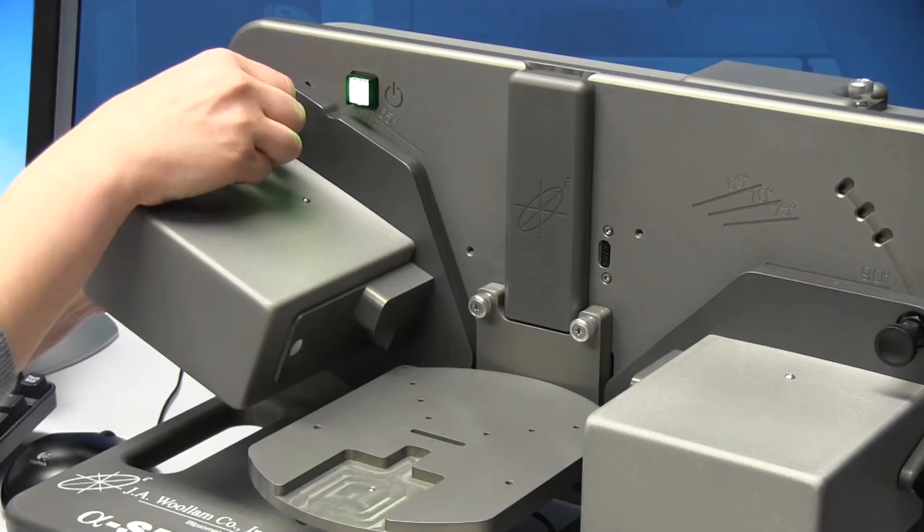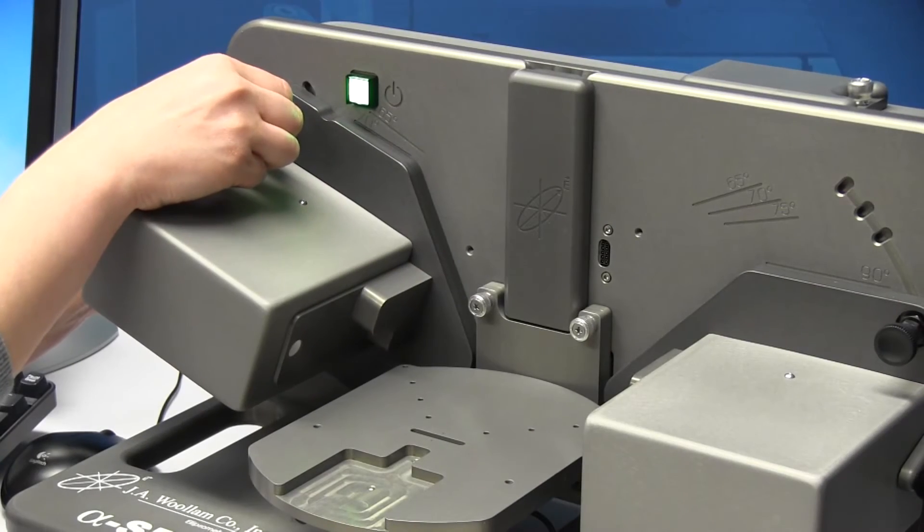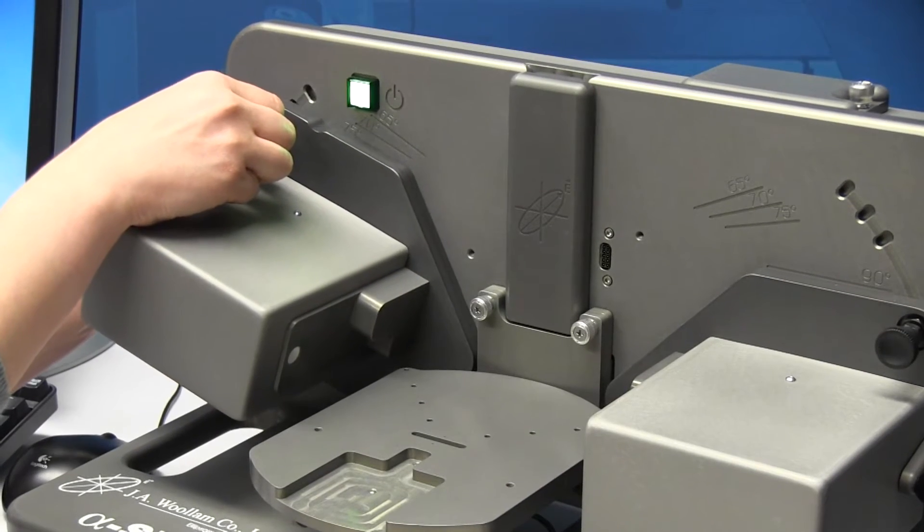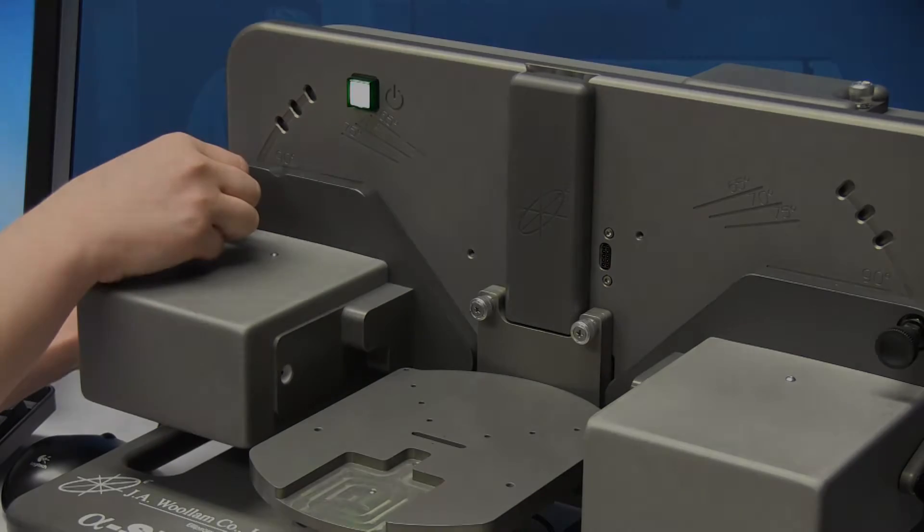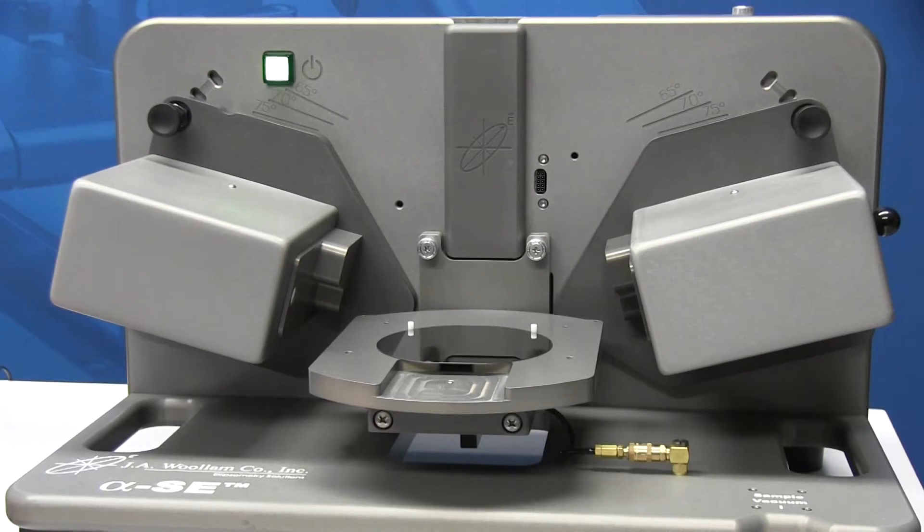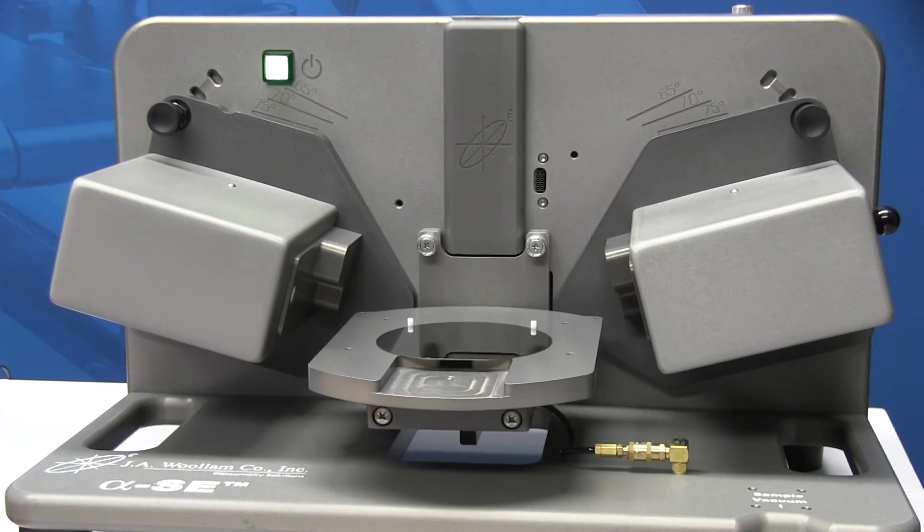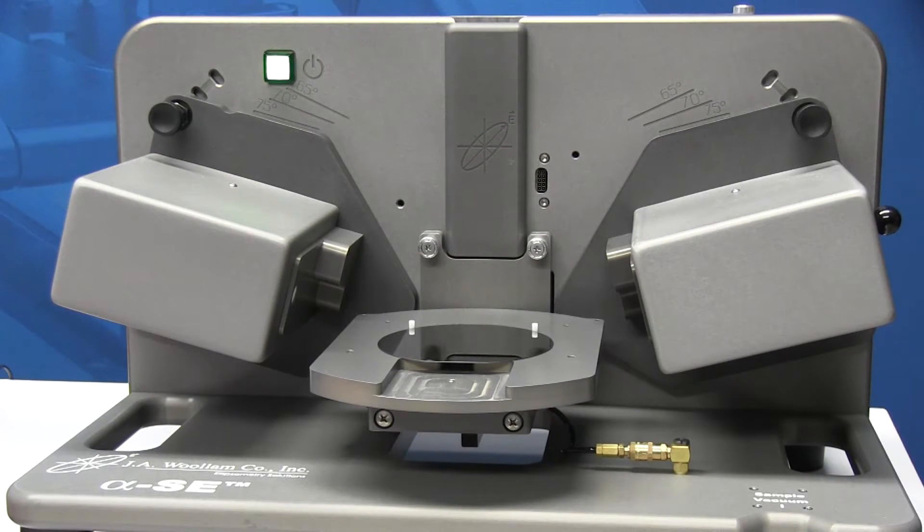There are three manually selectable angles of incidence, plus an option for straight-through transmission measurements. Sample height alignment is automated.